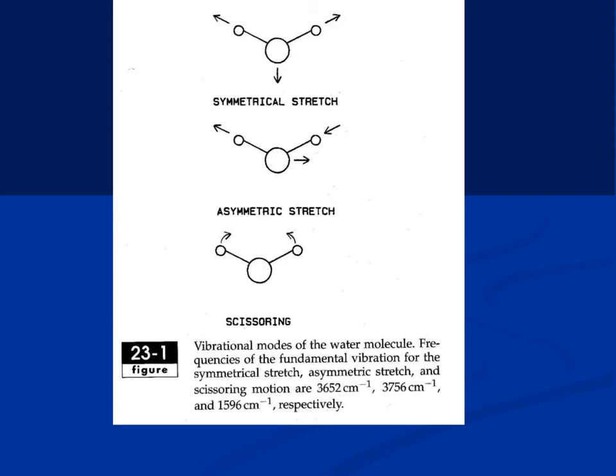Again, it's exactly the same as what happens with the UV spectrophotometer solutions. The same parameters are applicable: temperature, solvent, impurities, pH. All these things may affect the environment of the molecule, and hence the absorbance and the reading of the fluorescence.